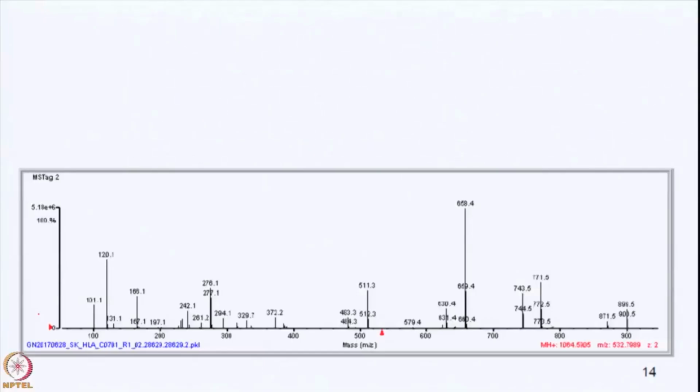All right, so this one is another HLA peptide, but the allele is C0701. I forget what the C terminus is for that, so we're going to have to figure it out. All right, where will we start here?